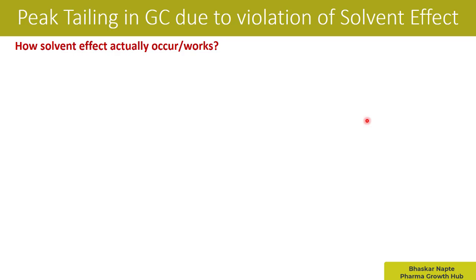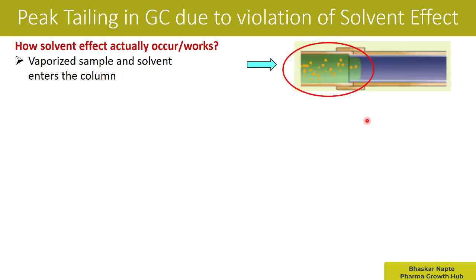How does the solvent effect actually work? This part is very important. The vaporized sample and solvent enter the column — during injection, the injector port has a high temperature to convert the sample from solution to a vaporized form. This vaporized form of the entire sample goes into the column. In the diagram on the right, the green portion is the sample solvent in vapor form, and the brown spots are the vaporized analytes — they are just entering the column.